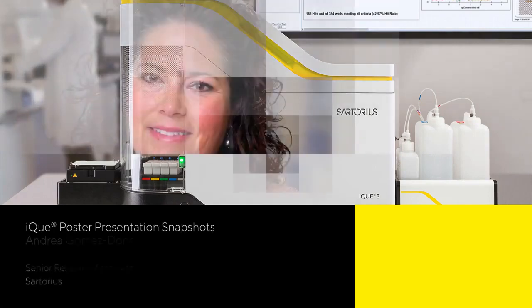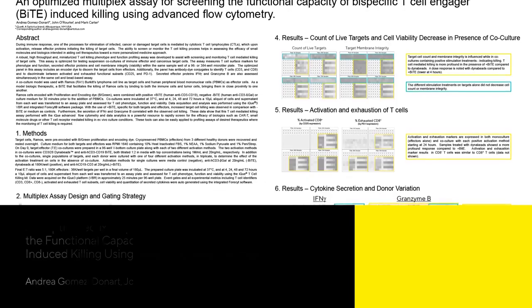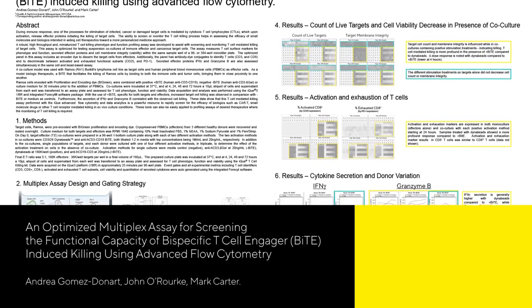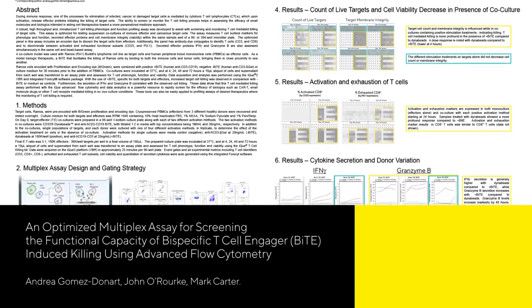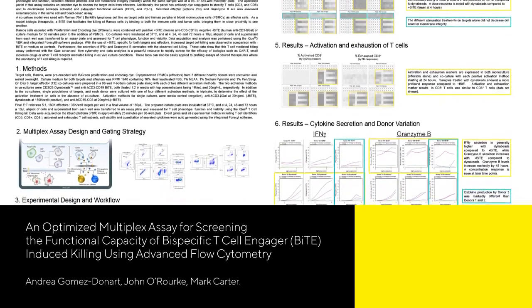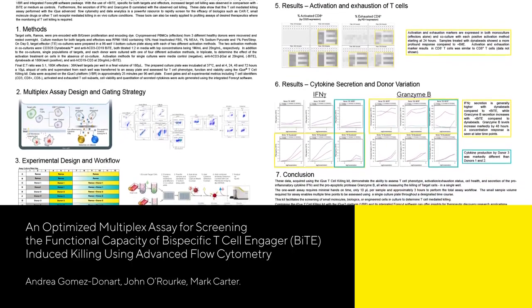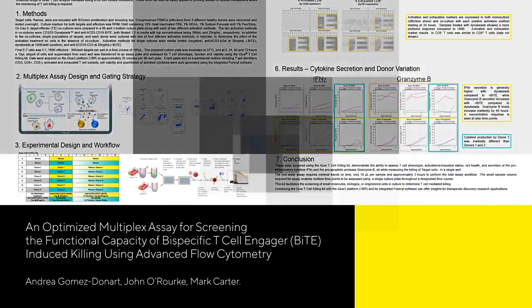Hello, I'm Andrea Gomez Donart, one of the scientists at SARTORIUS in Albuquerque, New Mexico. Today I will be walking you through one of our posters presented this past August at CITO, and this poster is titled An Optimized Multiplex Assay for Screening the Functional Capacity of Bispecific T-Cell Engager-Induced Killing using Advanced Flow Cytometry.